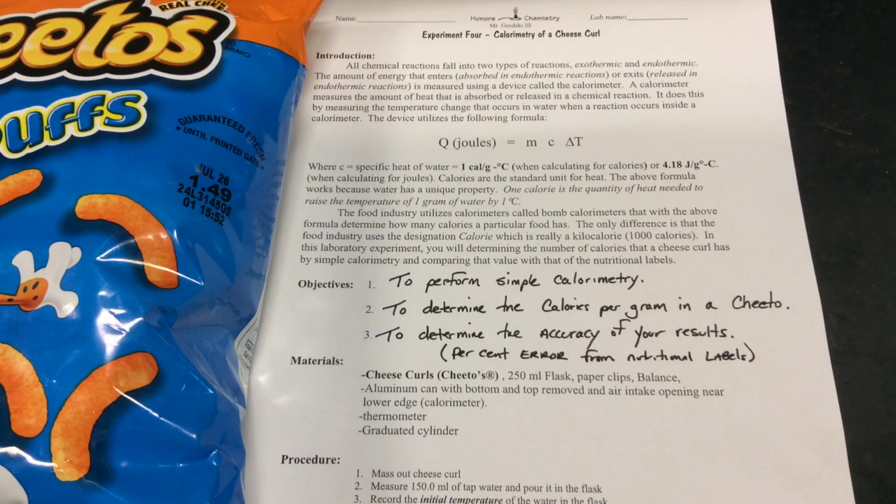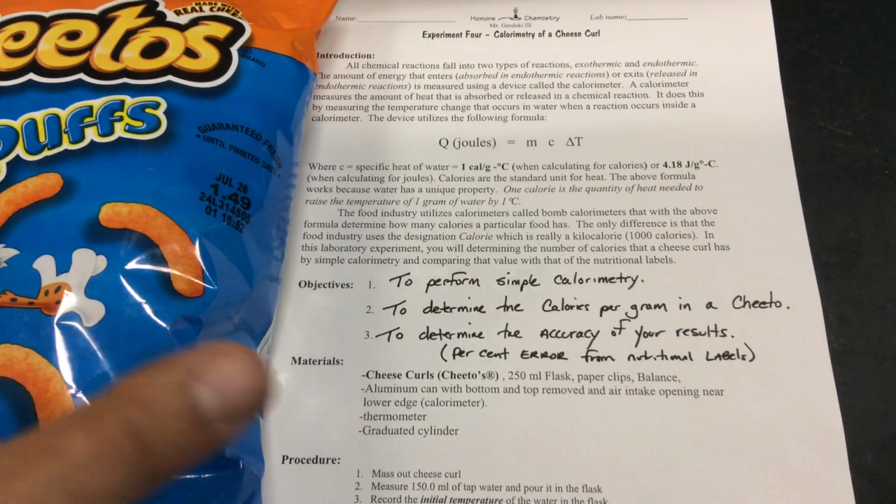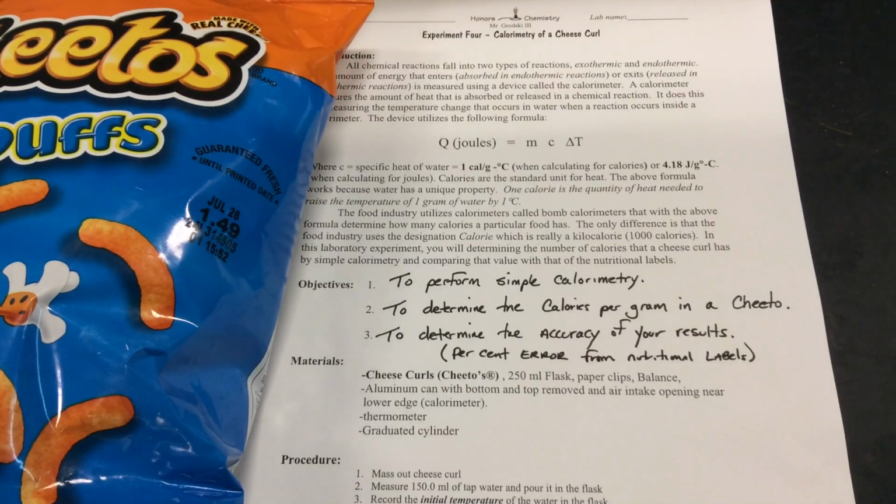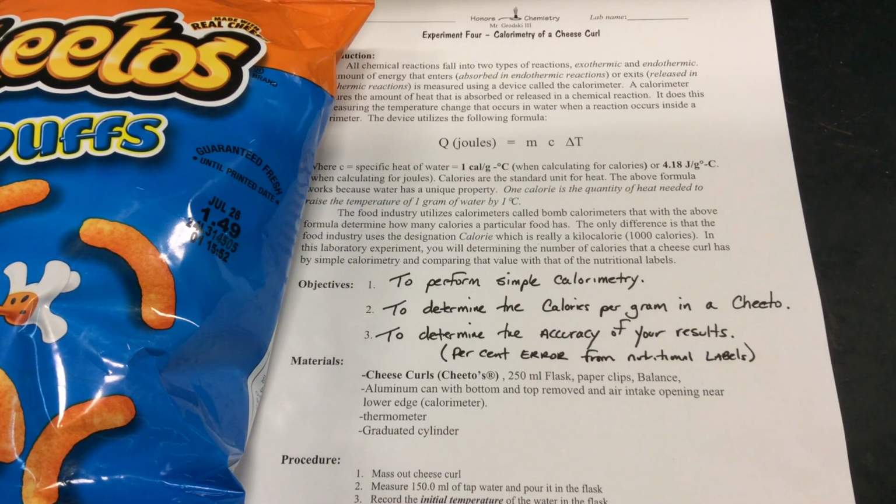In this lab, we're going to perform some simple calorimetry, and what we're after is the amount of calories per gram of Cheetos. So we're going to take a Cheeto and essentially burn it, combust it. It's going to undergo a chemical reaction. It's going to be exothermic.